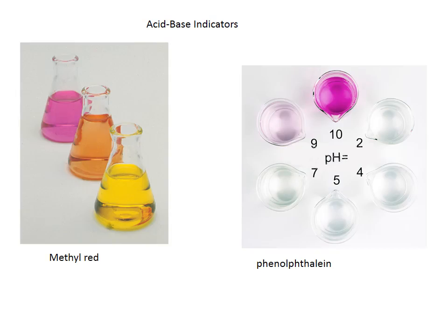Here is methyl red, which goes from yellow to red, and there's an intermediate color that's orange. That's a mixture of the two different colored molecules.